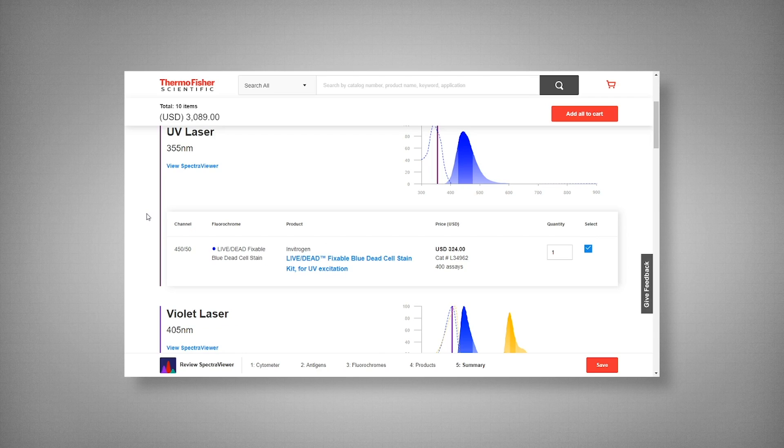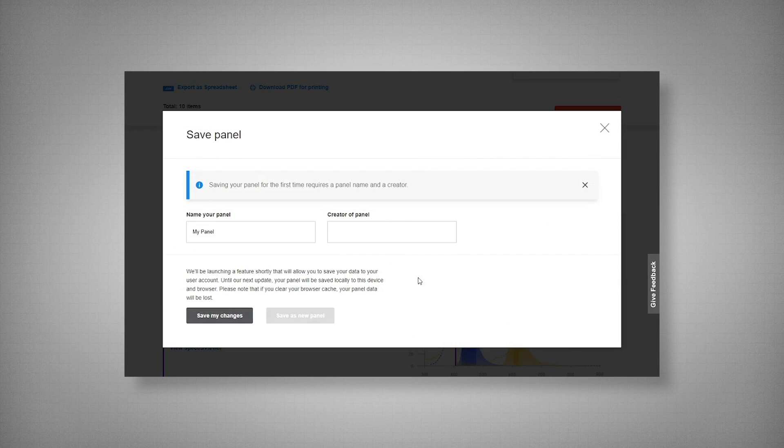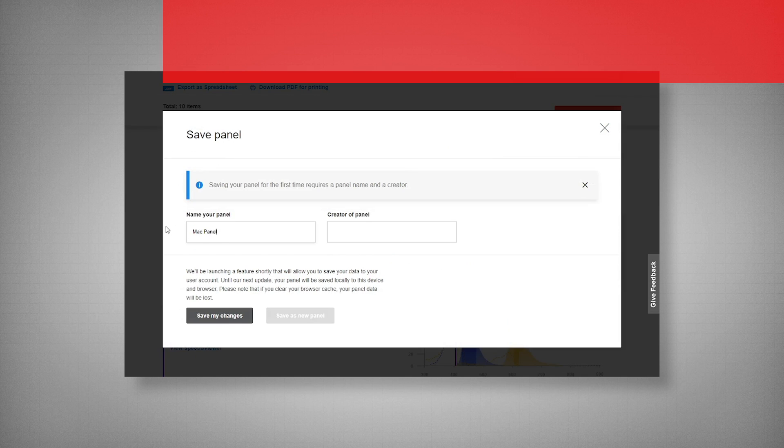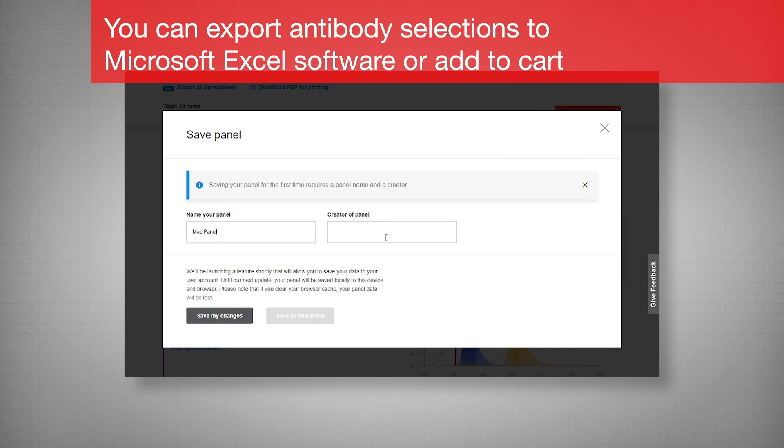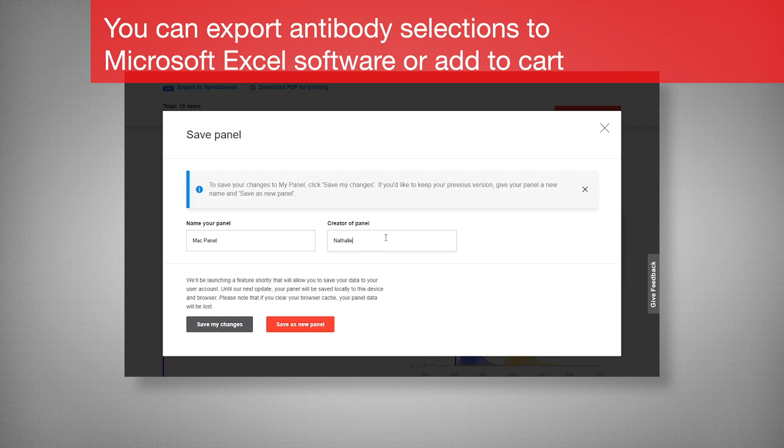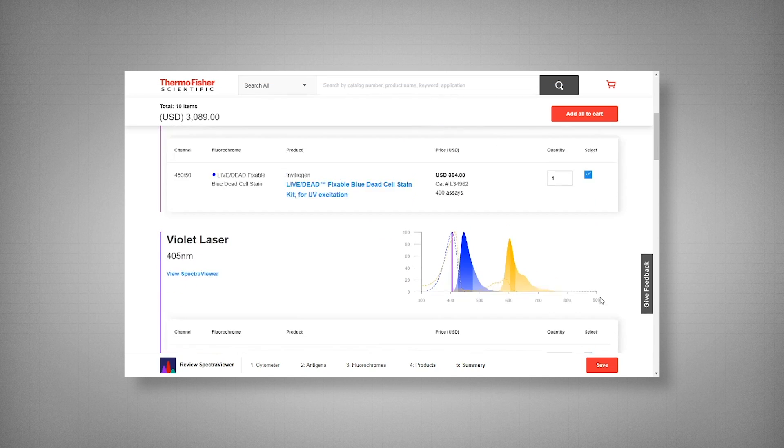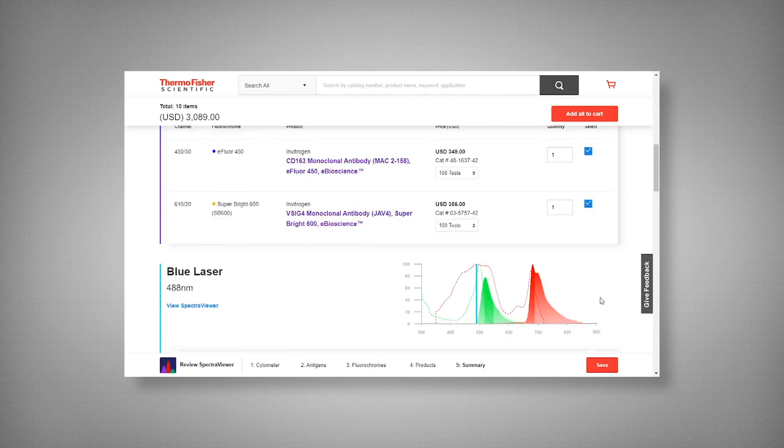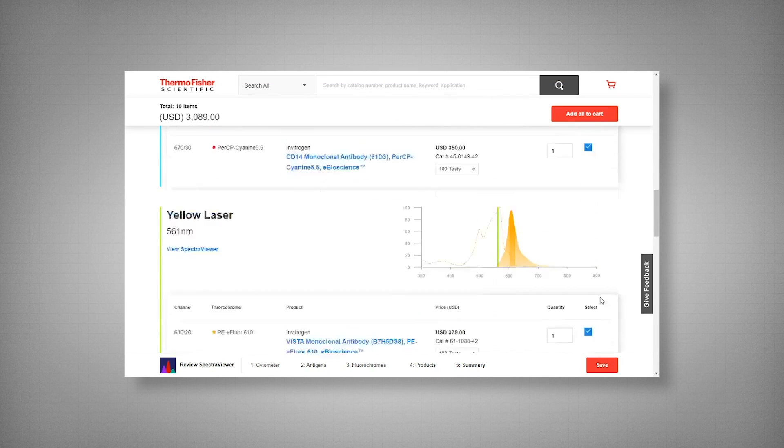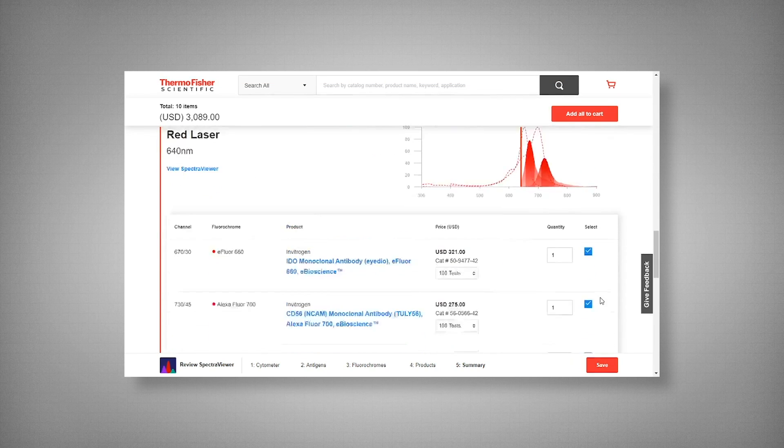So here, you can save your panel. I'm going to call it my Mac panel. And creator. Simply save and you can go back to it. And with this we are now ready to, we're one step closer to beginning our experiment.